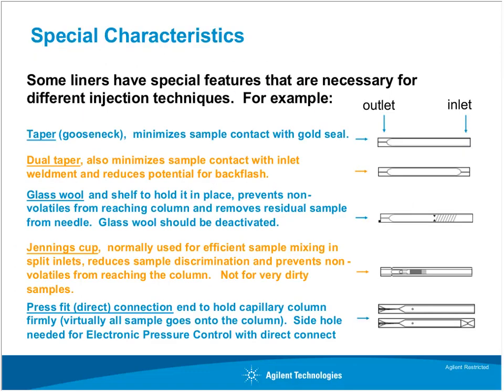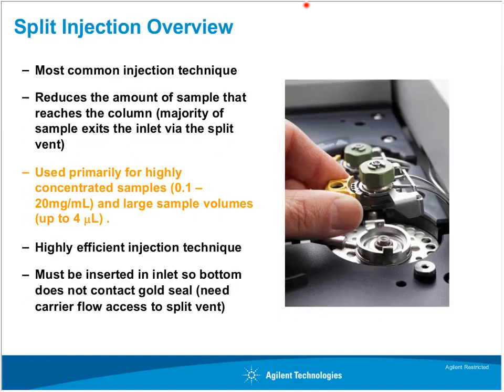And I'm not going to go through all this. This is for your guys' reference. I believe you'll have a copy of this after the presentation, so if you wanted, you could go back through and look. But as you can see, we have so many different types of liners that are all going to be beneficial for different types of applications. And so choosing the correct liner is going to be key, and again, minimizing issues that you may have.